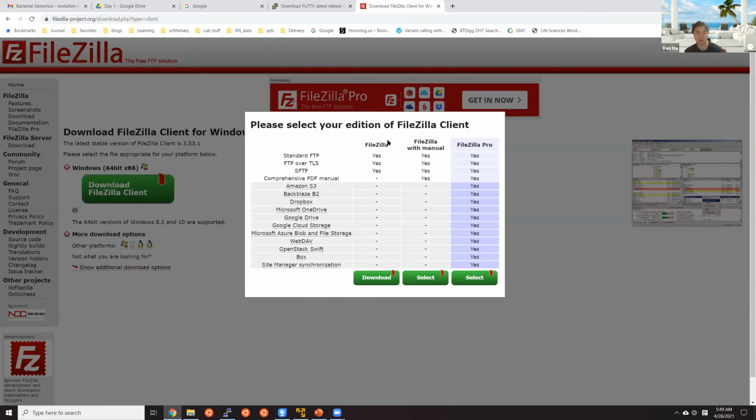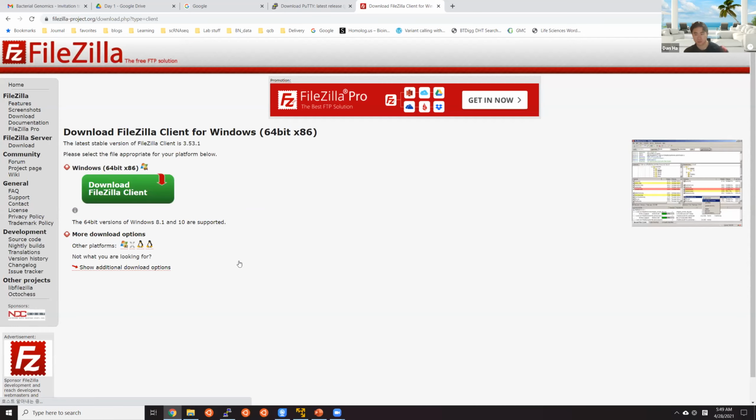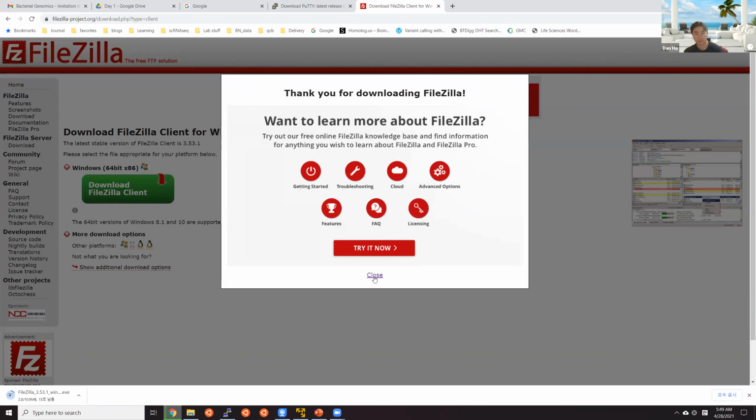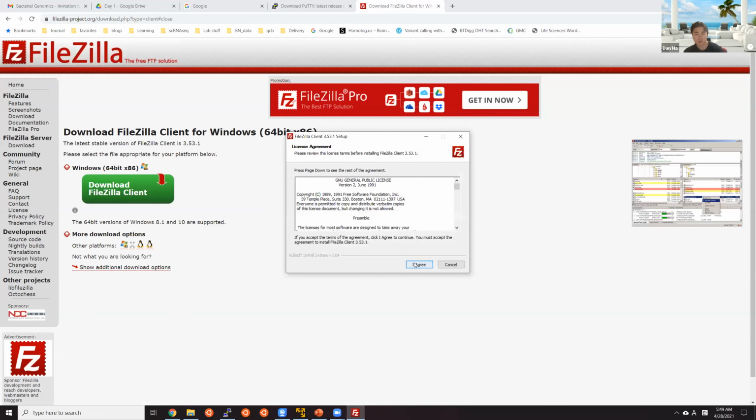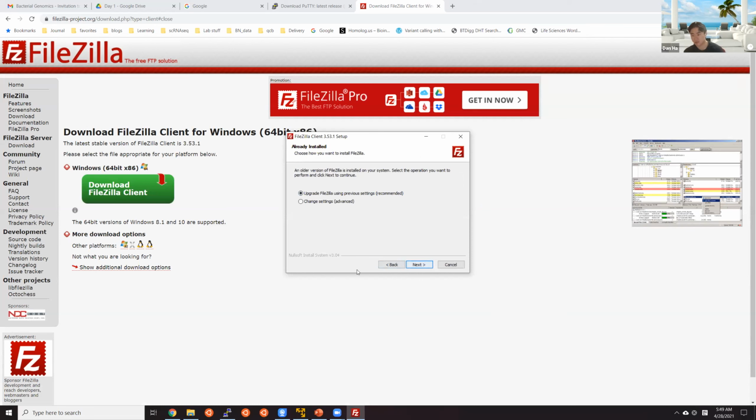You can click on download and download the free version and get it installed. I already have it installed on my computer, so I'm not going to install it.